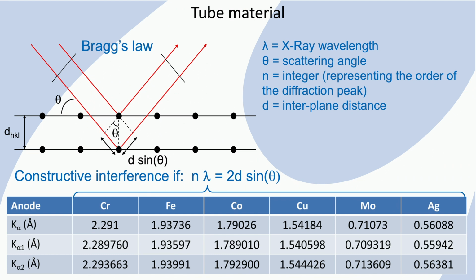These X-ray beams are usually paired in what we typically see as K alpha 1 and K alpha 2, with specific ratios in intensities. Depending on the software used to analyze the spectrum, the K alpha 2 intensities can be removed. The most used X-ray tube as the source for the X-ray beam today is copper, but other tubes are used for specific applications.